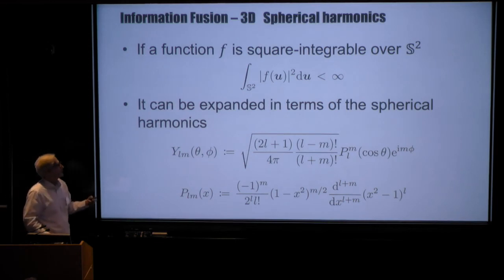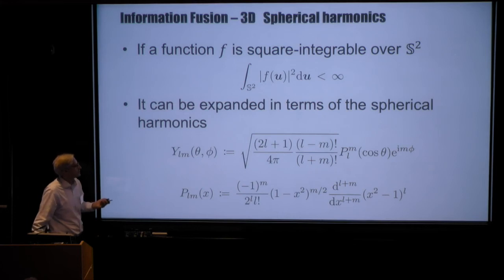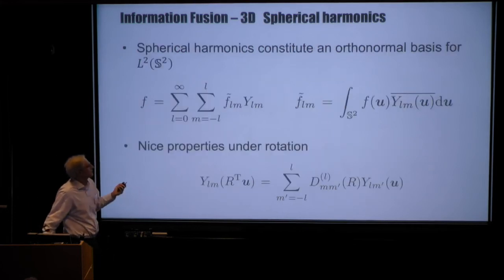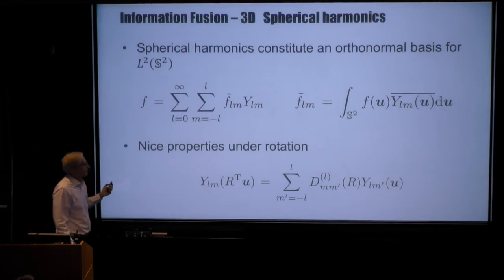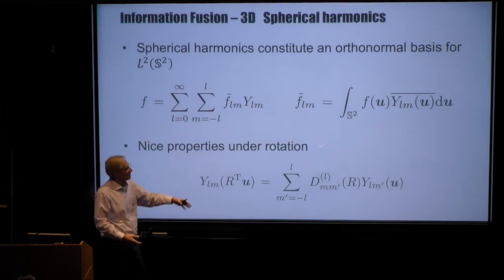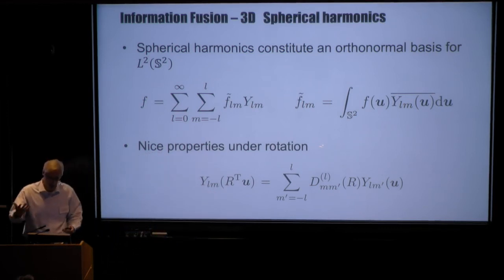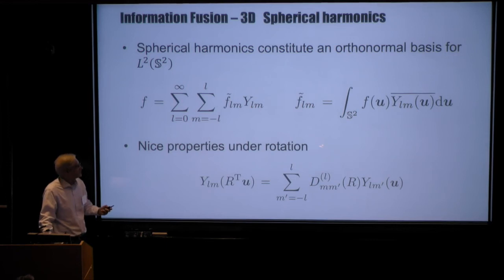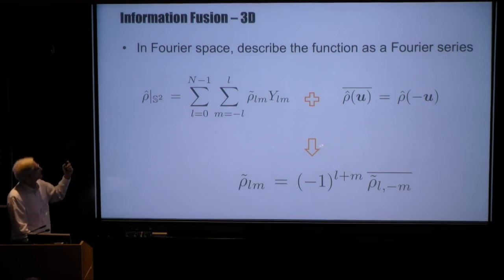Okay, so then we need spherical harmonics and other things, which I think everybody here knows about. If you have a spherical harmonic and you rotate it, you can re-express it in spherical harmonics, and the weights in that re-expression are the Wigner D matrices, or Wigner D functions, the entries in the Wigner D matrices. And so we use that, but first let's back up.